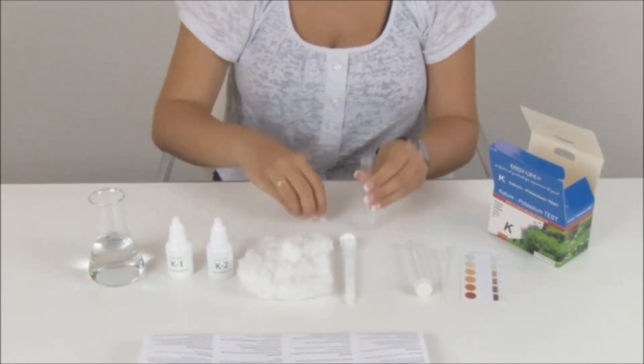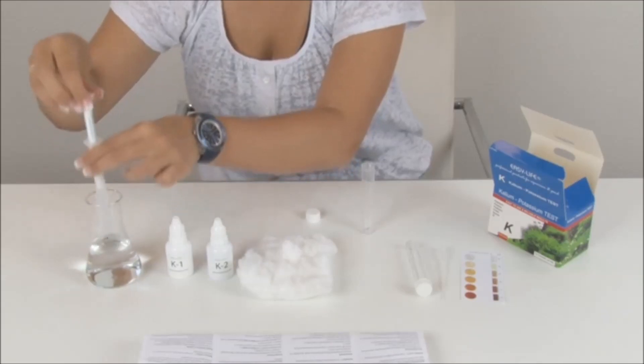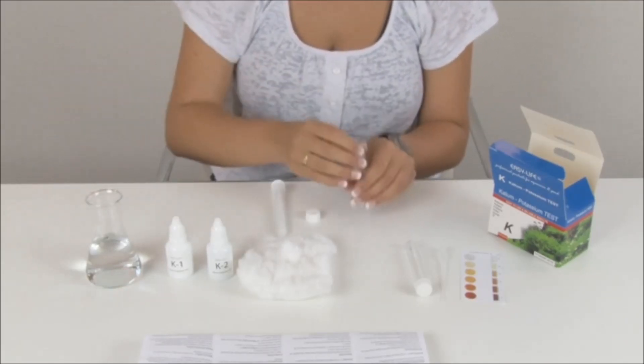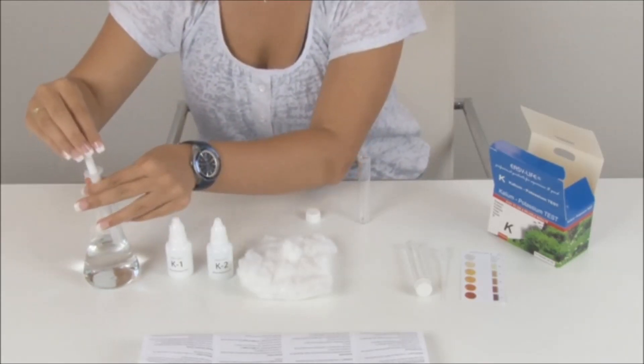Rinse the test tube with some sample water, then fill it with 2 milliliters of sample water.